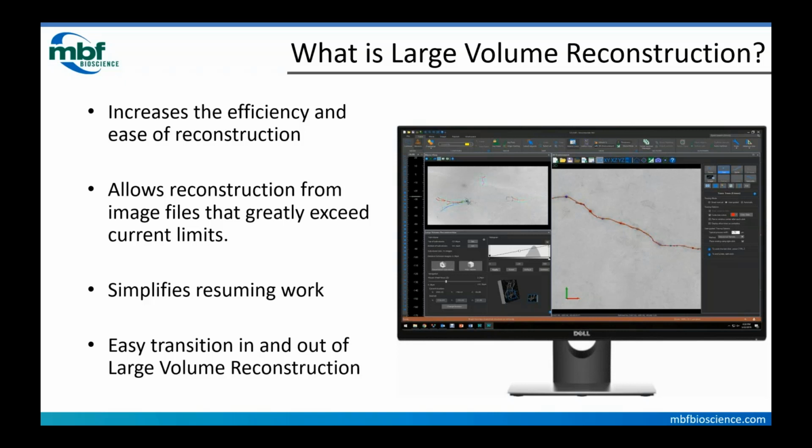And so this is a way that will make it a lot more intuitive to modify the parameters to suit the image data that is representative of the neuron that you're looking to get that morphometric data from. So the image is just part of that process. We want to get these numbers fit to the neuron that you're actually interested in looking at.